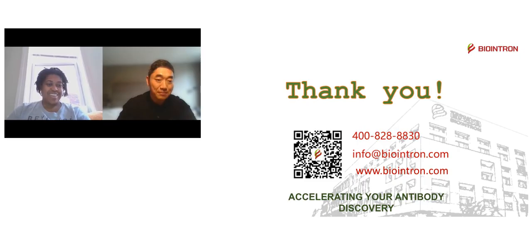Absolutely. Okay, and then I think the last question that I see is, why did you use the mouse as the benchmark when you used rabbit to produce the antibodies? Is there an advantage or disadvantage to that strategy? I think that's from case study 6. Good question. By saying benchmark, actually the benchmark works as a positive control, because when you do plate-based or cell-based screening, you need to make sure your assay works. So first we need a positive control to set up this test to make sure it's functional and we will not get false positive signals. In many cases, as long as this benchmark works well enough, it's good enough. Second, we call it a benchmark in many cases because we want to beat it. This is the exact case when you raise some antibody for a drug. So that's what we call a benchmark.